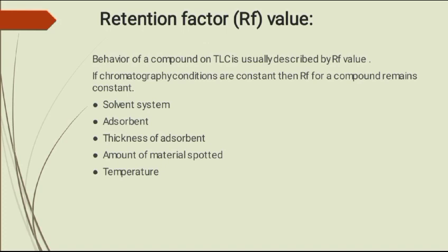Retention factor or RF value. Behavior of a compound on TLC is usually described by its RF value. If chromatographic conditions are constant, then the RF value for a compound remains constant. What are these conditions? Solvent system, adsorbent, thickness of adsorbent, amount of material spotted, and temperature.